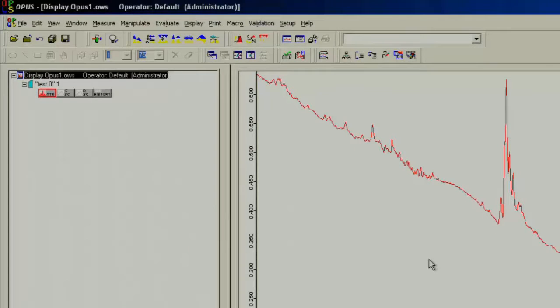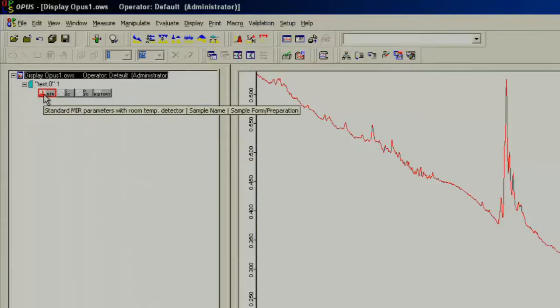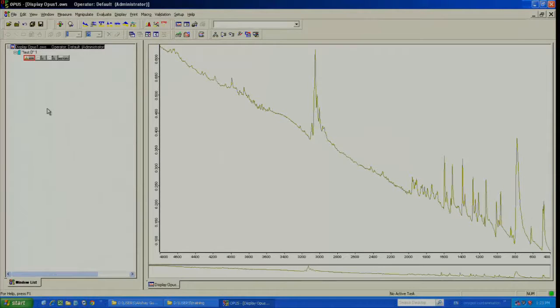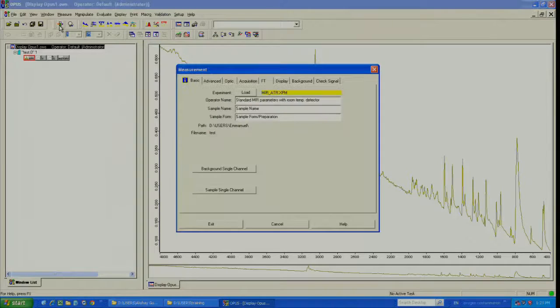You can change the color of the pattern by clicking the little box labeled ATR in the top left part of the screen. Now if you want to measure a second sample, go back to the test tube, and then you want to load your second sample.